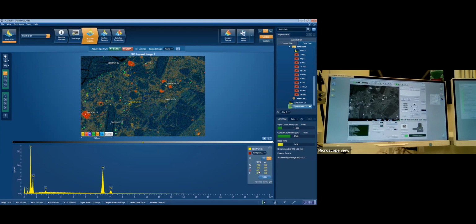So often we find chromite that is also really rich in aluminium, or it could be rich in magnesium. And this kind of creates a solution where you can swing between different minerals with all kind of the same composition. So you can often go from chromite into spinel if you just jiggle things around a little bit, which makes it very interesting. And it also makes the EDS a very powerful tool for that.